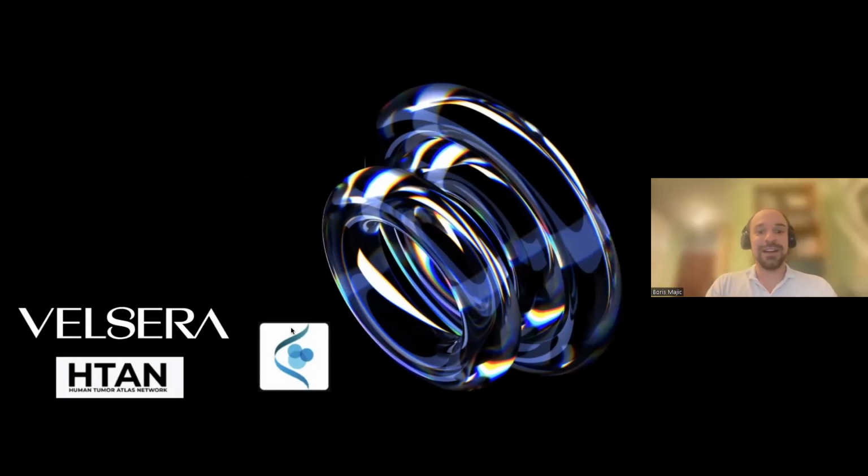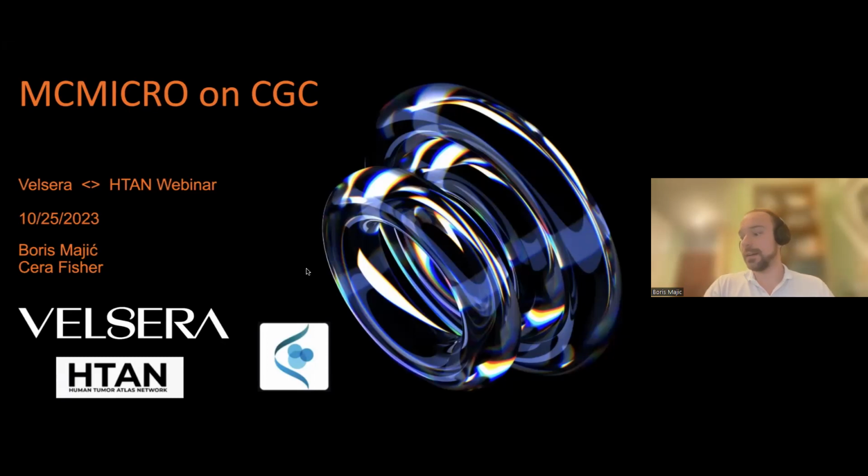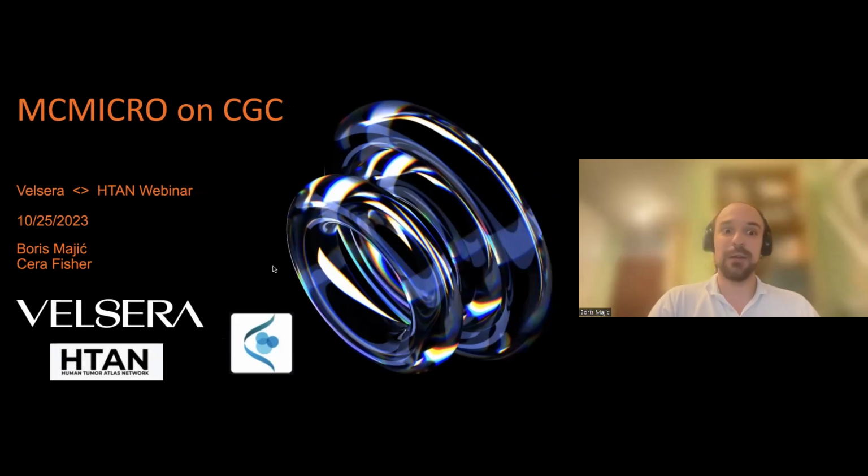It was great collaborating with both developers and users of MCMICRO to bring this tool, which is otherwise a workflow made for Nextflow, which is not a native language for workflows on our platforms.